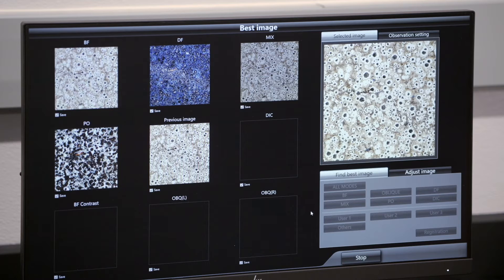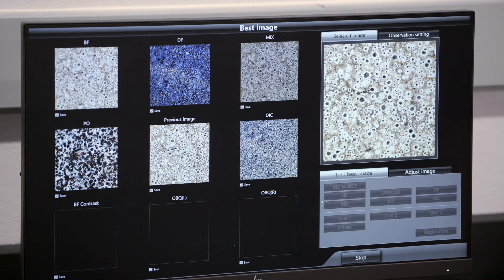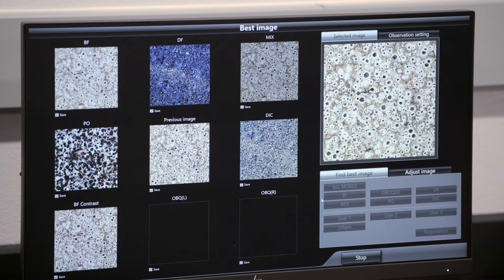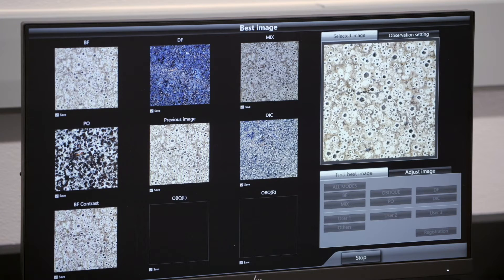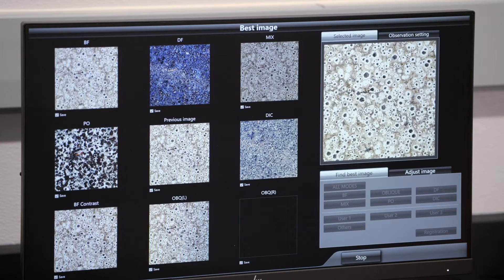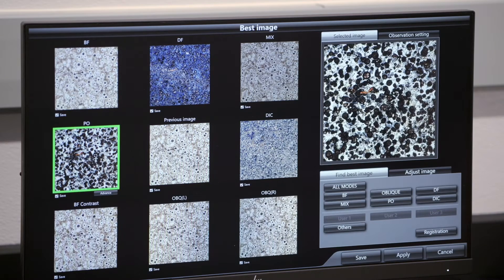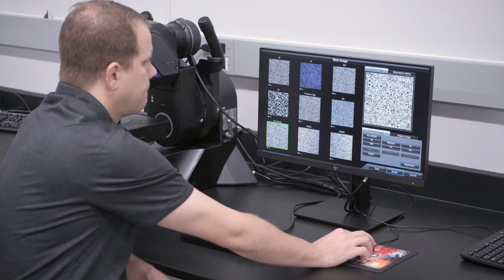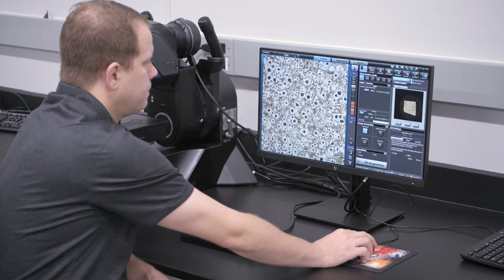Objectives are equipped with brightfield, darkfield, mixed illumination, polarized light, differential interference contrast, contrast enhancement, and oblique illumination modes. All of these modes are achievable with the same objective and by optical means rather than digital post-processing.